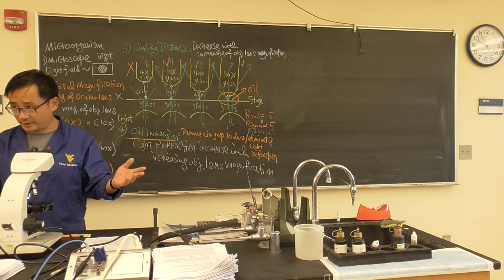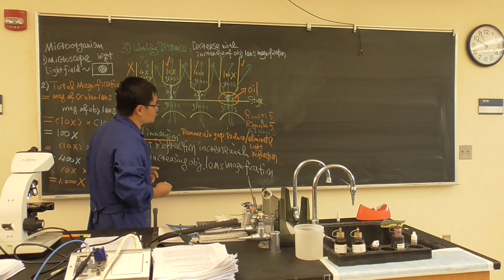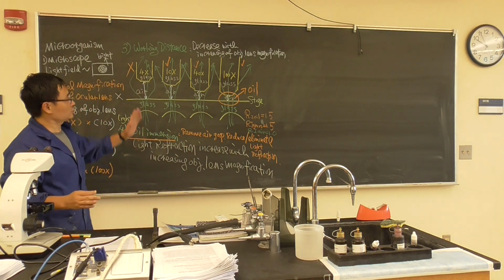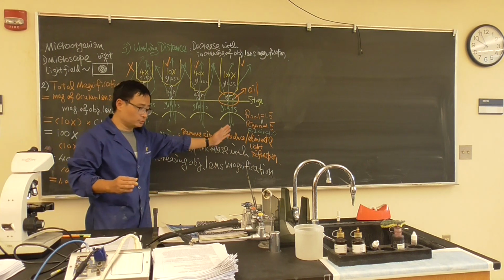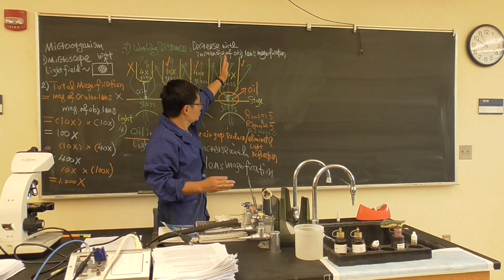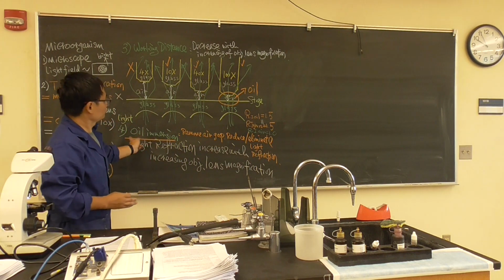We could see the pathogenic molds. So that's the only time we're going to use the 40x. But most of the time, we're going to stick to 10x, find the specimen, add 1 drop of the oil, do the oil immersion, switch to 100x. So that's something we want to talk about, oil immersion.